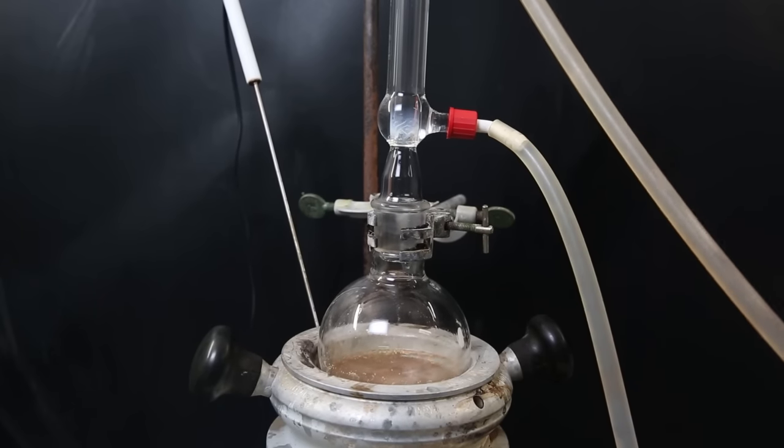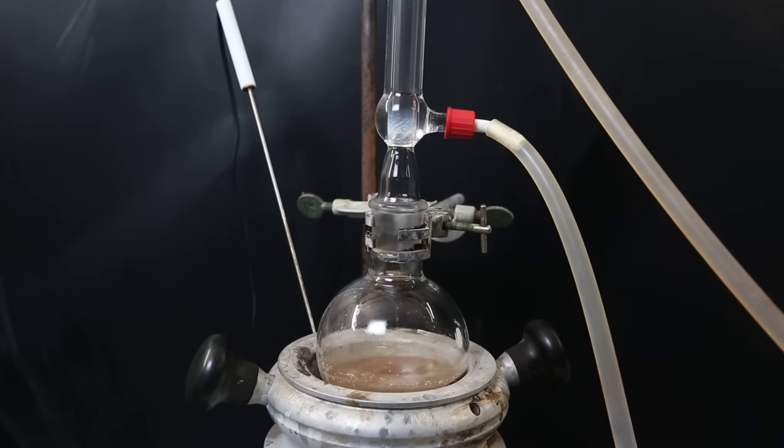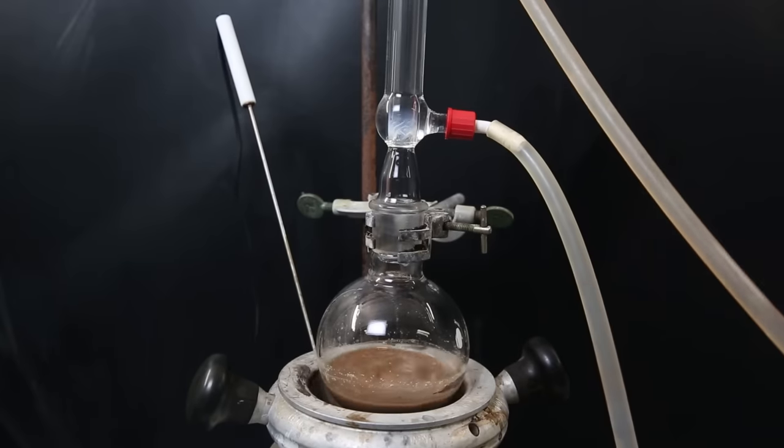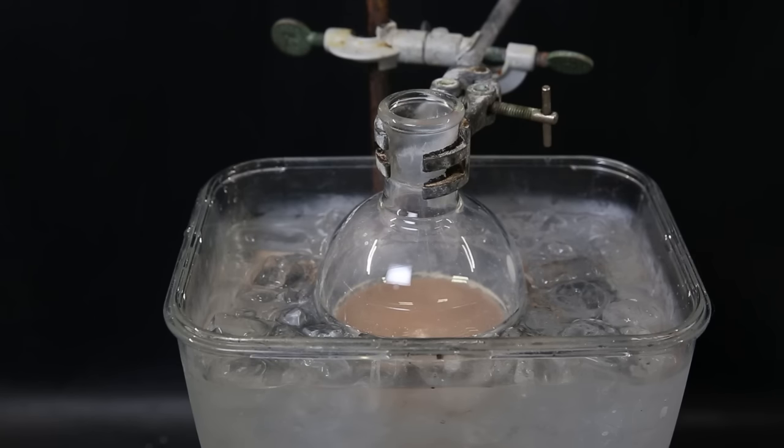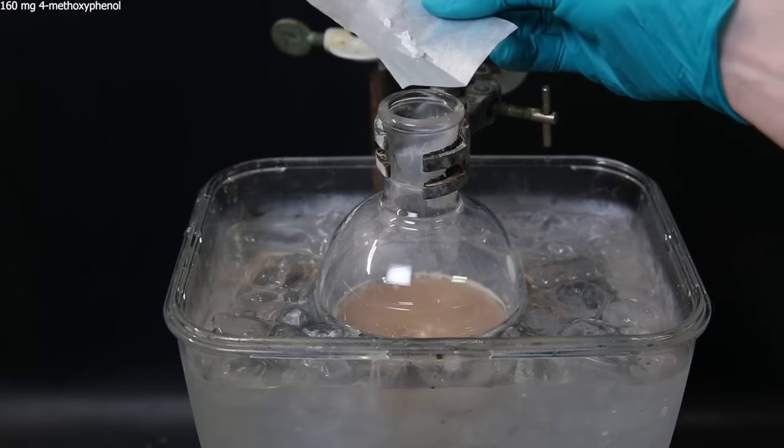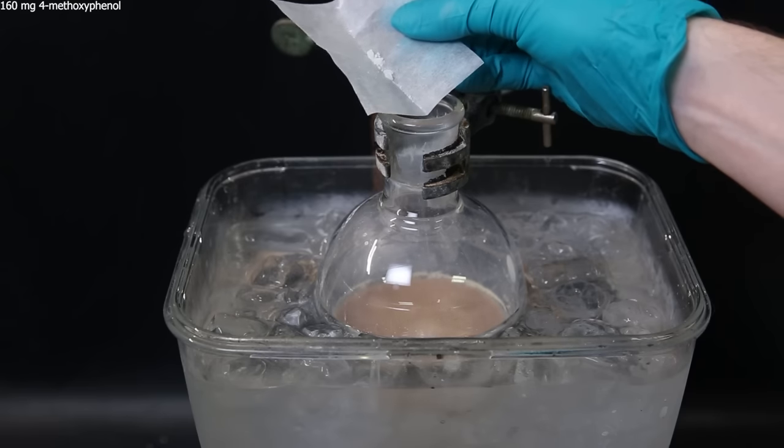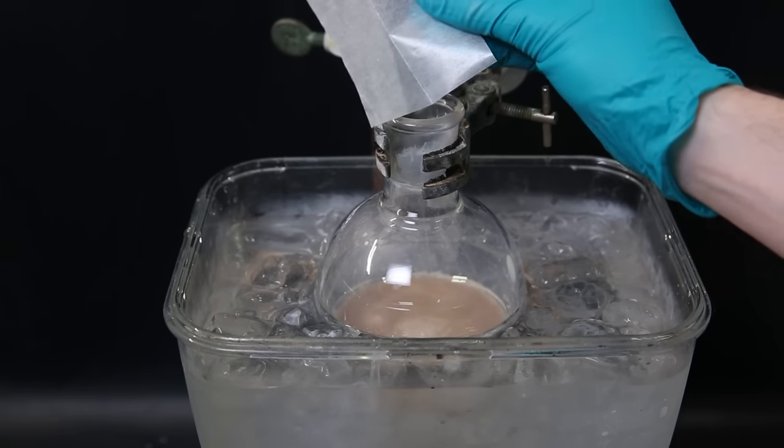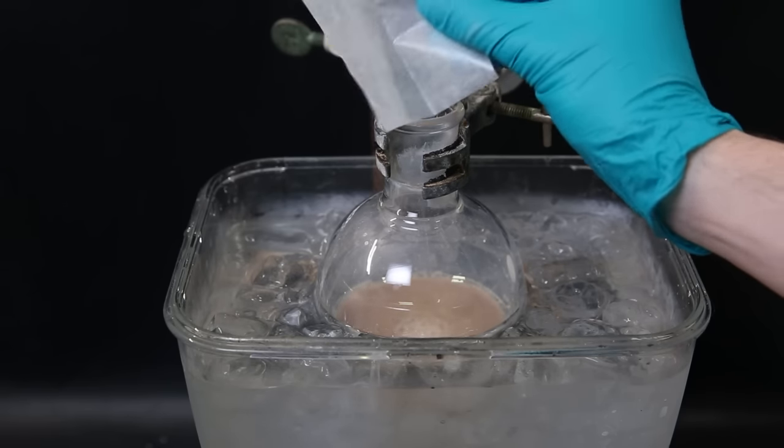When I come back the next day, the mixture has turned brown and the reaction should be finished. So I take the flask off heat and then set it in an ice bath. I let it cool down and then add 160 mg of 4-methoxyphenol, which will quench any radicals and work as a stabilizer for the tributyl tin hydride.